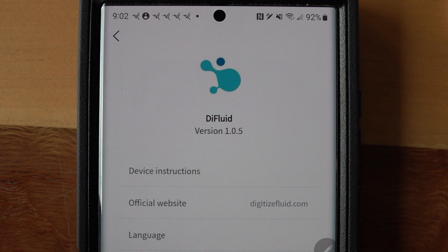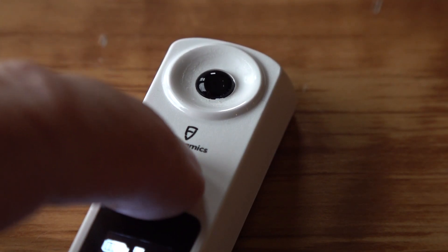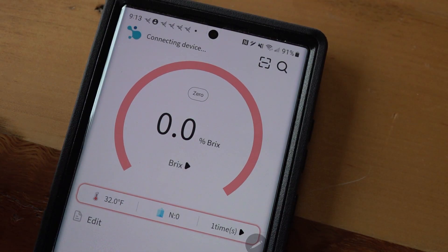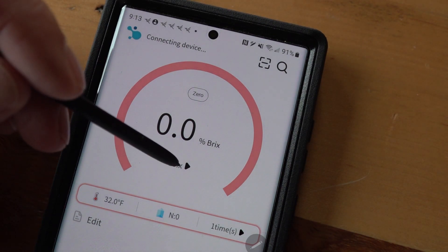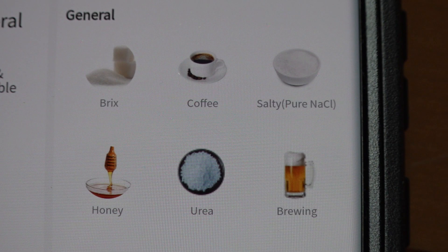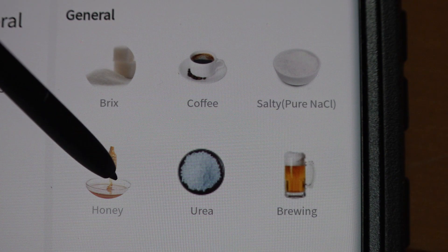I also went to the device instructions on their website — guess what, that page doesn't work. When you go to the official website they just want to sell you other stuff. That green light comes on when you know it is refracting light. Light either passes through at a normal incident angle, or it refracts at other than a normal incident angle — it can transmit, refract, or reflect.